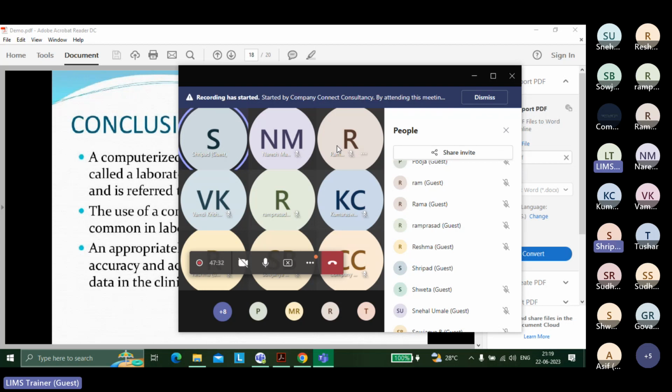Yeah, because I'll discuss what a sample is, how the sample table works, what a test is, what a variation is, what master data is, what static data is, what dynamic data is, why we are using them, and how this is there in LIMS. Also what the user table is, and how you can configure roles in LIMS. Like I can tell you this role can do this, that role can do that.